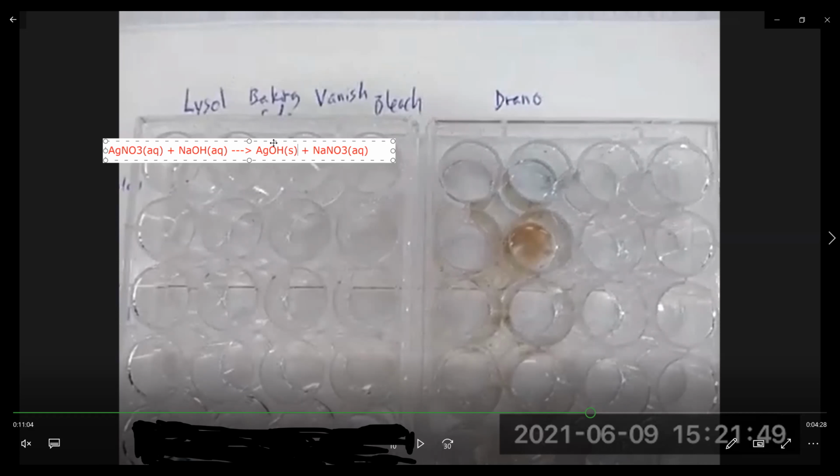So this is how you would explain your results. You're saying, well, when we add the silver nitrate, it reacts with the sodium hydroxide to form silver hydroxide and sodium nitrate, based on the solubility rules. So that's the reaction that's occurring in the second cell well plate. Also notice that the blue in the blue food coloring is starting to slightly dissipate. So it's reacting with the blue food coloring as well.